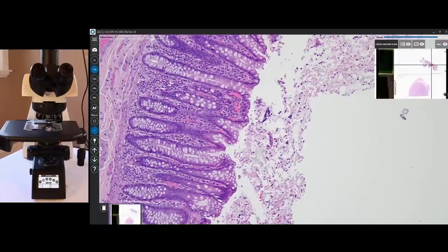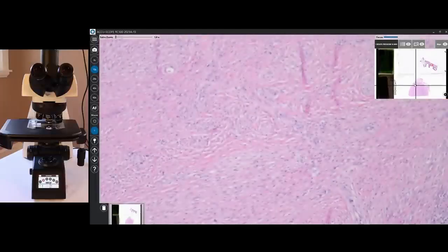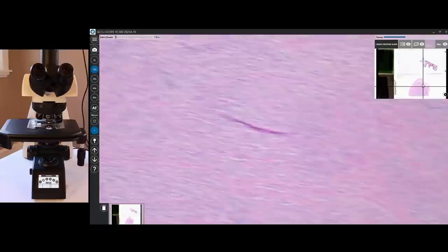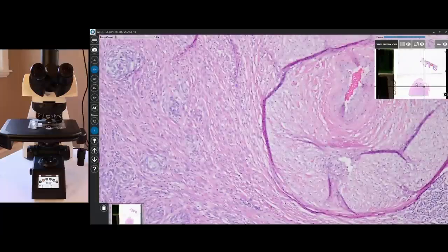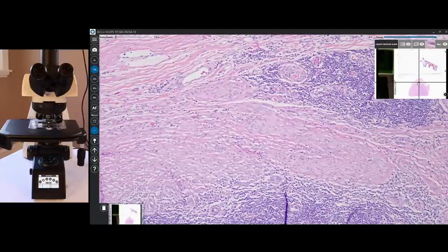We also have, again, our continuous autofocus. So here at 10x, I can go between my top slide and my bottom slide. And of course, no two slides are going to be in the same focal plane, but there we go in just a matter of seconds. We have our autofocus function taking control and getting us really nicely in focus here. Even as we pan around a non-flat slide, the software is constantly going to be doing an autofocus for us.